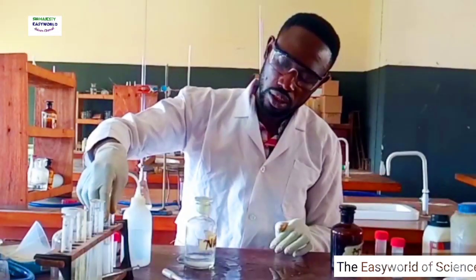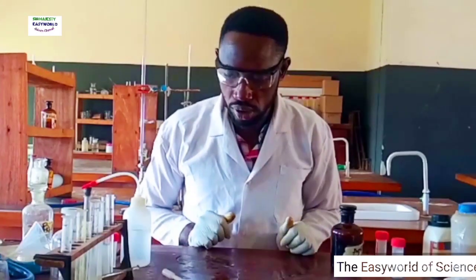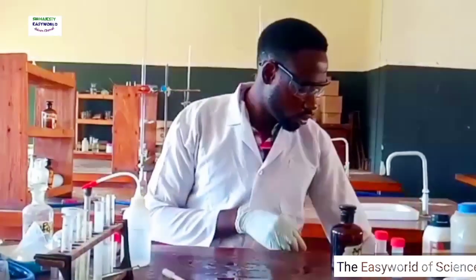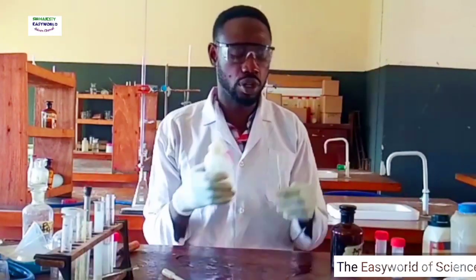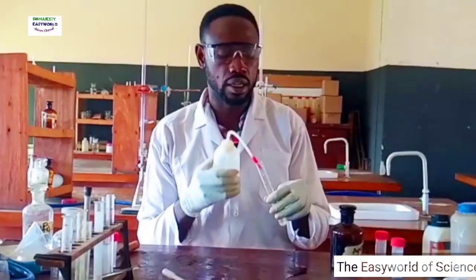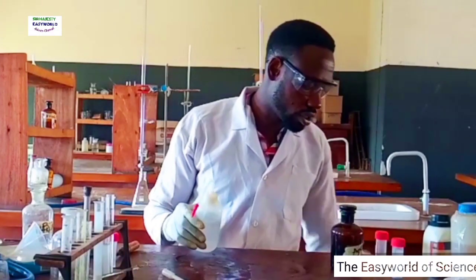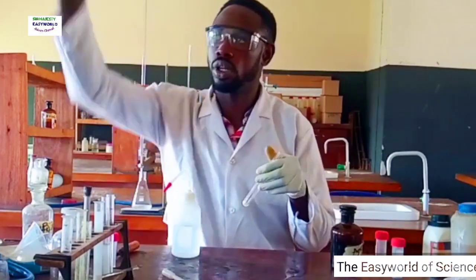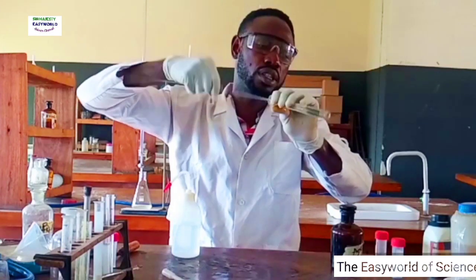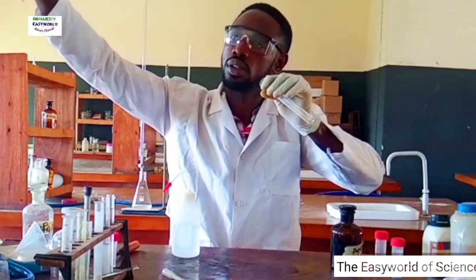Now, the next possible thing you might be asked to do is to mix solutions, or the last portion of solutions A and B, or solutions E and L, C and D, no matter what they call it, but just to mix the two solutions, that's lead nitrate and calcium chloride. I told you if you do this, what's happening is actually double decomposition.